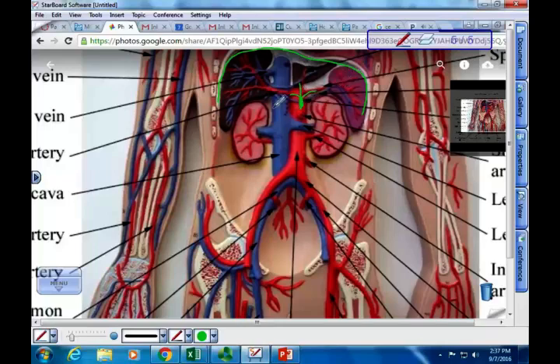Okay, so celiac trunk comes up, and then there is 1, 2, 3 arterial branches coming off of it, like a tree. This one over here is going to the liver, so this is the hepatic artery. This one up here is going to a stomach that they have removed because the stomach's a little bit more anterior. So this is going to be a gastric artery, this red one that you see up here. Technically, there's a right and a left gastric artery and all this stuff. All you need to know is gastric artery, okay? And then this one over here is going to this organ, which is the spleen. So that's the splenic artery, okay? But this little stump that we see here, trunk, that's the celiac trunk. So the celiac trunk is just this section here. Once it branches, it gets new names, okay?